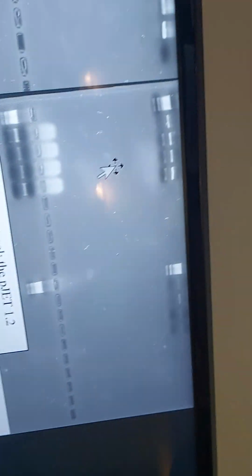And for minipreps 1 through 4, the bands are faint, so it's pretty hard to see, but the bands are definitely there. You can see 4 slight bands there, and on other groups there's also 4 slight bands. And these are actually 3,000 base pairs long, which is pretty significant.